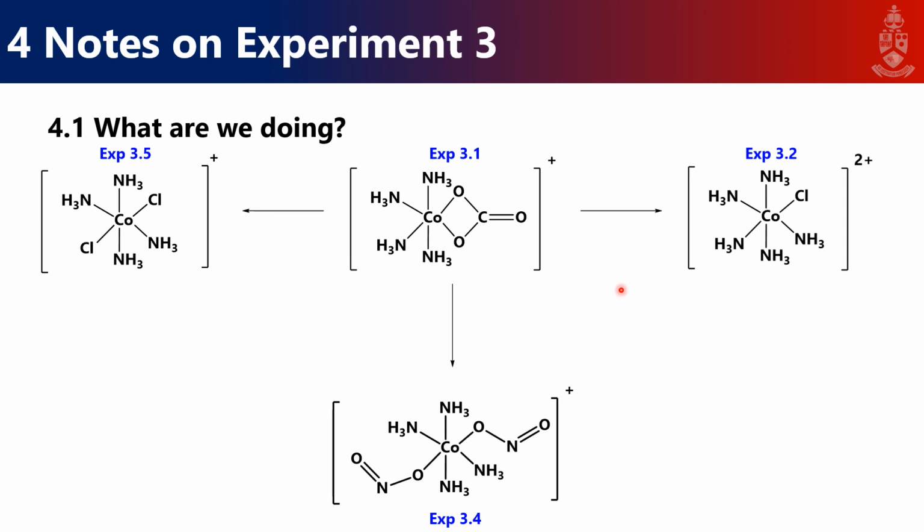And a final thing I wanted to remind you of, oh yes, remember when doing calculations of yields and for how much you need, or it's given to you in grams and whatnot, remember the molar mass of a complex contains the counter ion. So whatever the counter ion is crystallized here, that counter ion is contained in the molar mass of your crystal structure, and that is used to calculate the number of moles. It's not just the complex as you see it here with the charge.